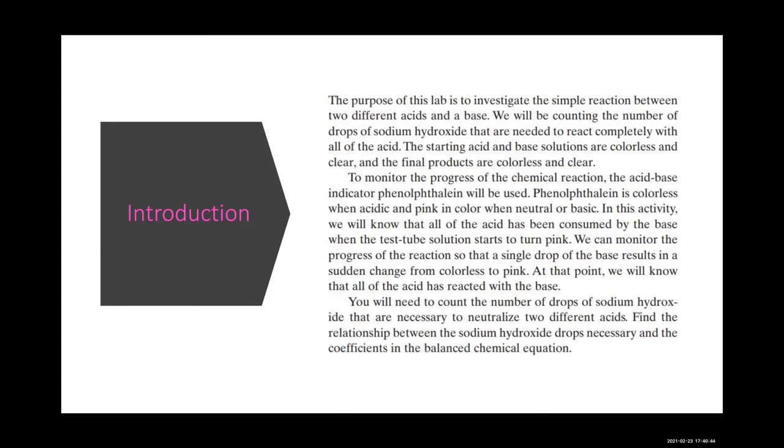We will be counting the number of drops of sodium hydroxide that are needed to react completely with all of the acid. The starting acid and base solutions are colorless and clear, and the final products are colorless and clear. To monitor the progress of the chemical reaction, the acid-base indicator phenolphthalein will be used. Phenolphthalein is colorless when acidic and pink in color when neutral or basic.